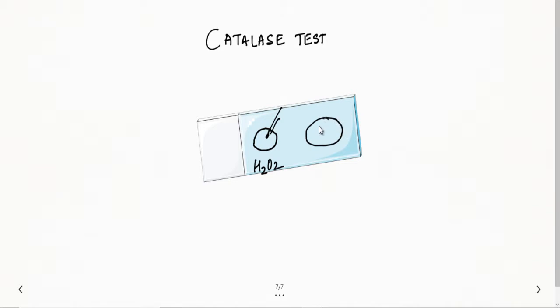If bacteria has the catalase enzyme it will start to show bubbles immediately within 10 seconds. So in 10 seconds you see bubbles. Now let us see how this happens.